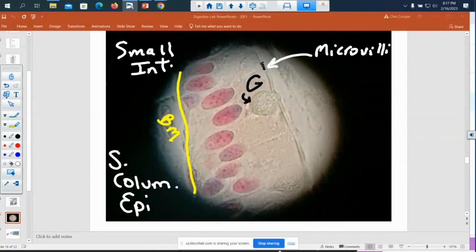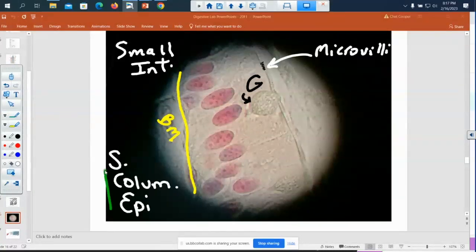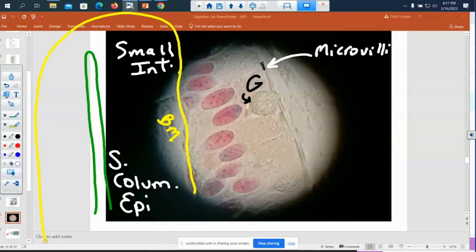On this picture, where would the lacteal be? Great question. Because remember, these go, those column-shaped cells go around the whole villus, right? So the villus would actually be pointing up like this, and they go up and over. So I could take the yellow over here. Let me get the yellow again. We go yellow. Watch this. We'll go like that. So the lacteal would be there.